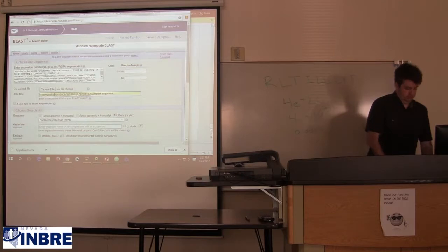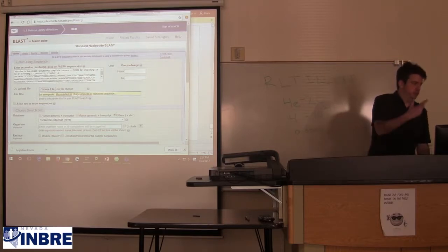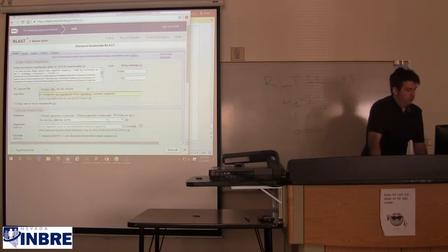Oh, I see. Right. And this doesn't affect the operation, just some of the text that will be included in your results. Like this will get shown in a couple of different places on the results page. It'll get shown on that temporary table of recent results. And that's why I moved it to the front, because that table gets shrunk. So whatever you choose to name it, or if you don't, it's up to you.